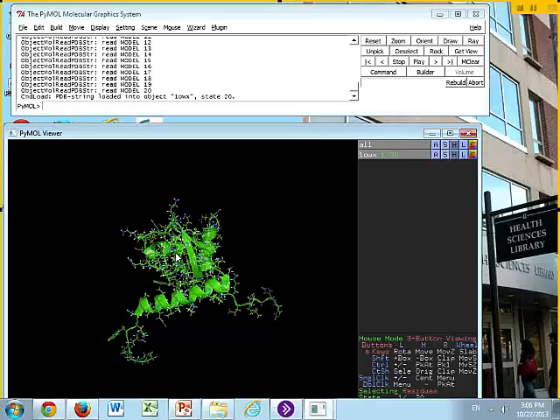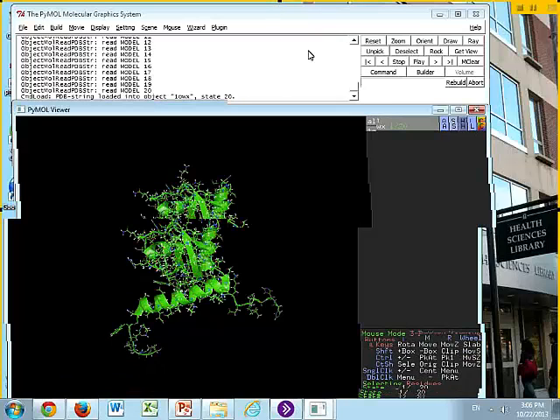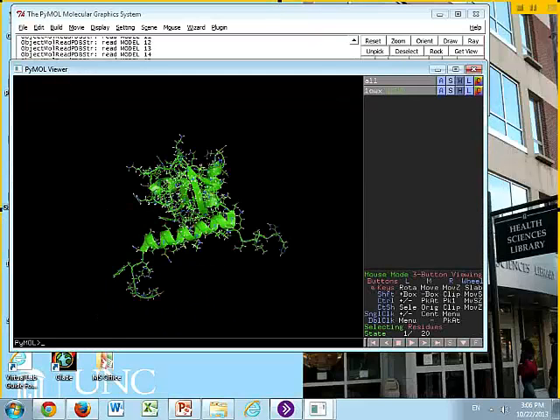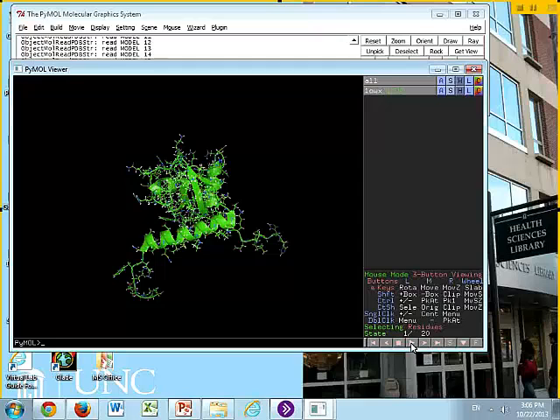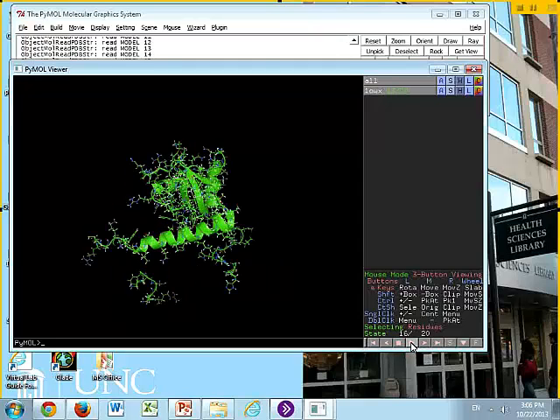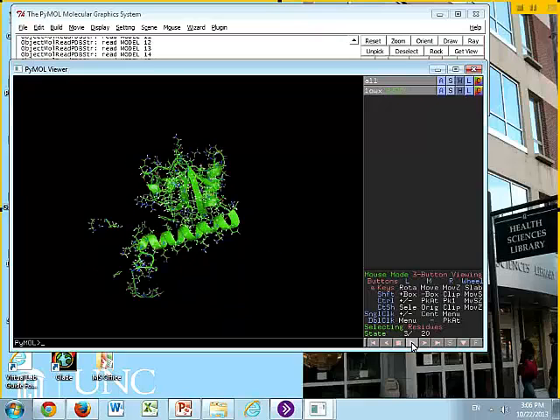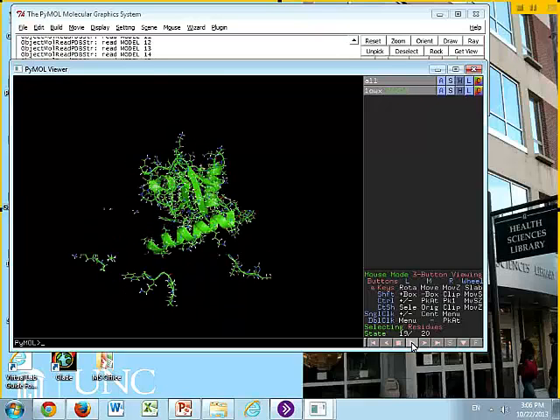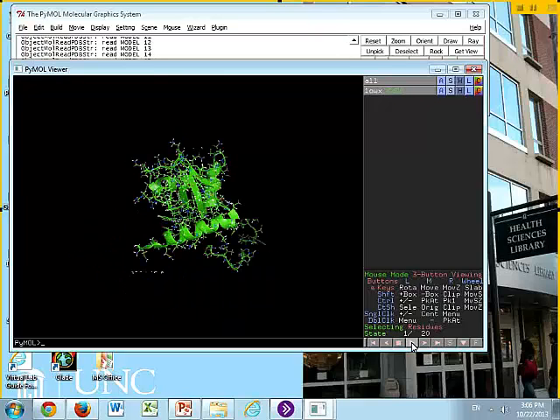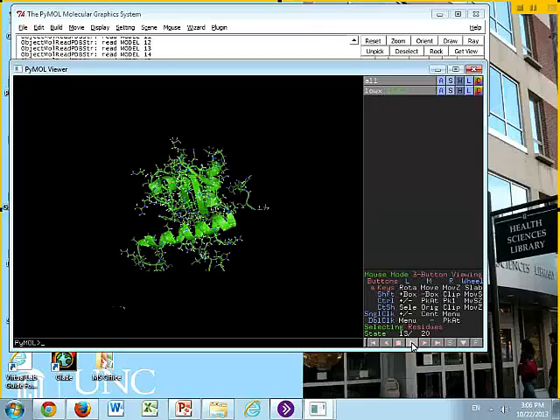Now we're going to come back and talk about all of these commands, but we're just doing a fun little exercise right now. Anyone having problems pulling this up? Okay. Now, all you need to do is come down to the bottom, and at the very bottom, on the right-hand corner, you have some movie displays. So you can just click run, and you'll see it's flipping through those 20 structures. Everybody see that? Alright.